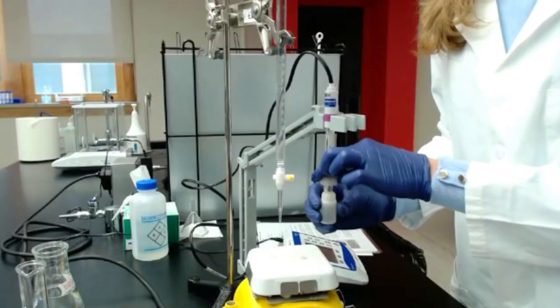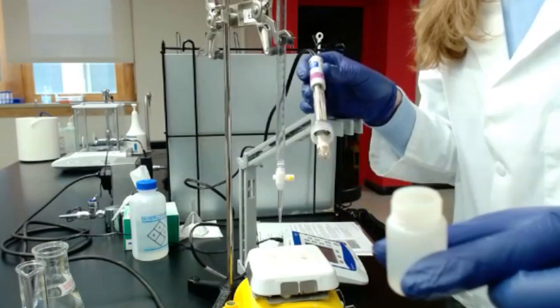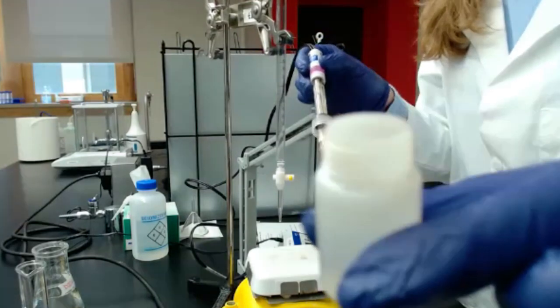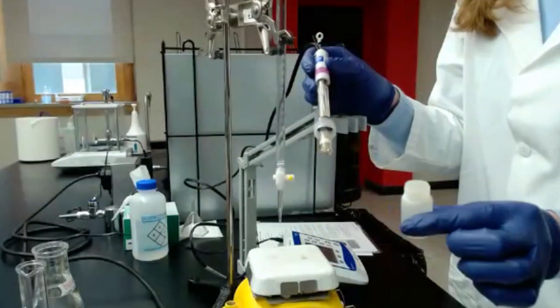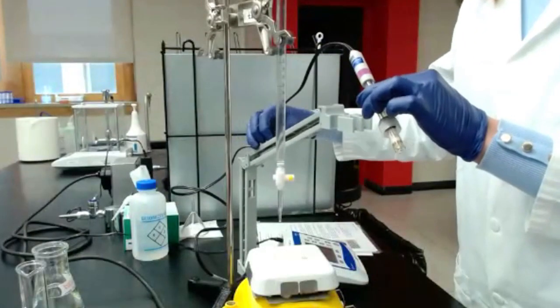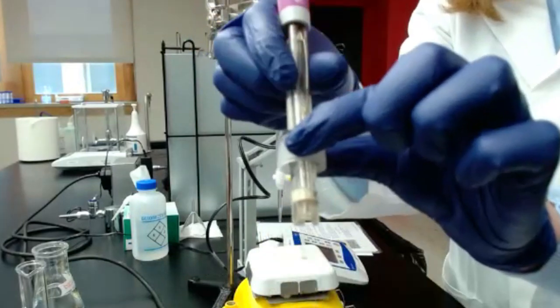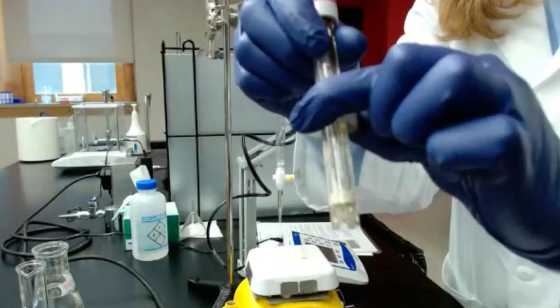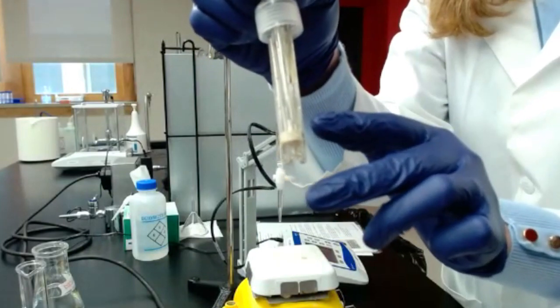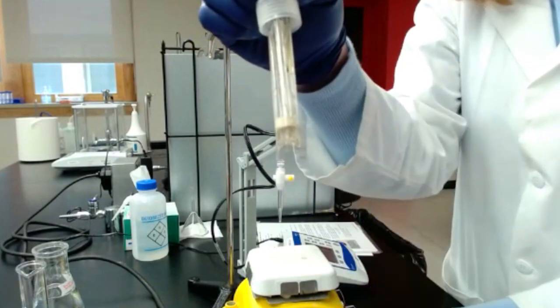To start the calibration, you might need to remove the storage solution. At the end of the probe of the electrode, we have a container that has storage solution. Make sure you remove that and put it on the side. That's the electrode that we have. Make sure you move that part away because you will need a big piece of the electrode in contact with the buffers.